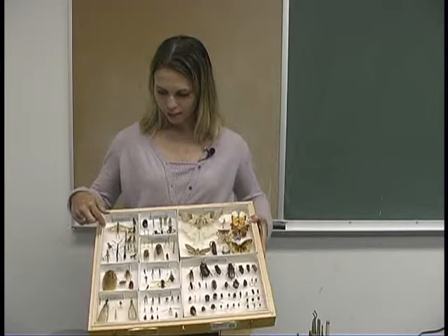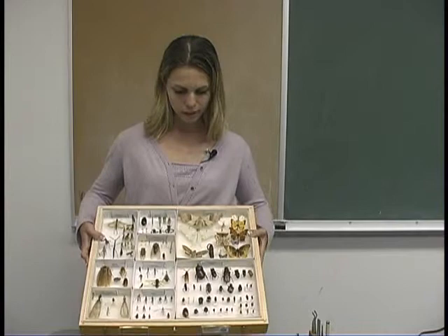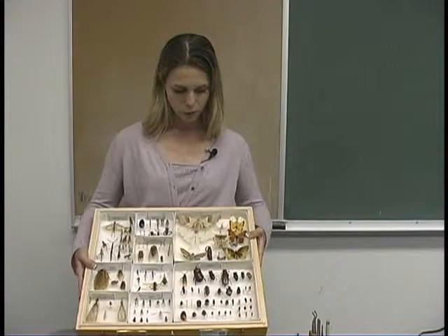My name is Kim Schofield and I'm a program specialist for IPM with Texas Cooperative Extension. Today we're going to discuss a little bit about pinning. For the placement of the insect pins as well as labels, they need to be standardized, and a well-ordered collection will place each of the insect specimens together according to their order.